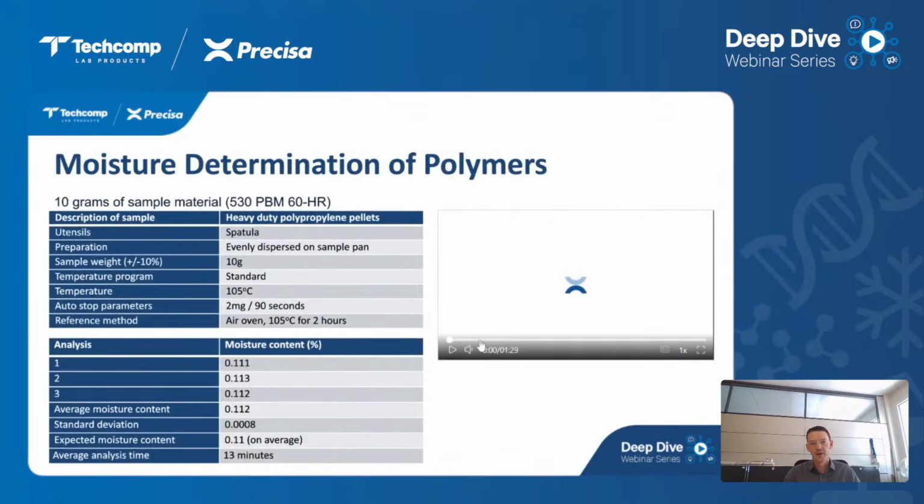Now let's have a look at how we tested this polymer. Here we have a video which is also available on YouTube, where you can see how the moisture analyzer is being programmed and the analysis is being executed.